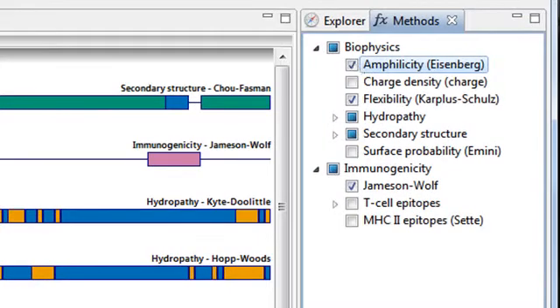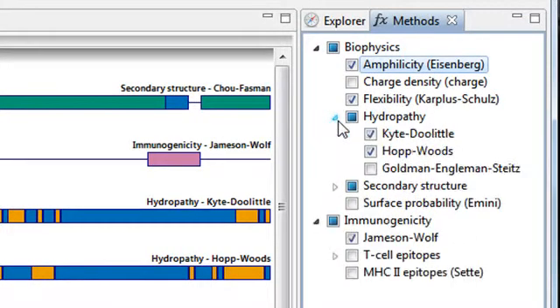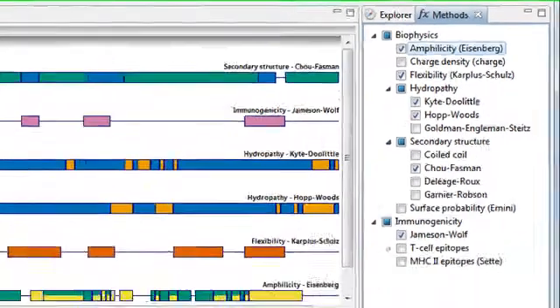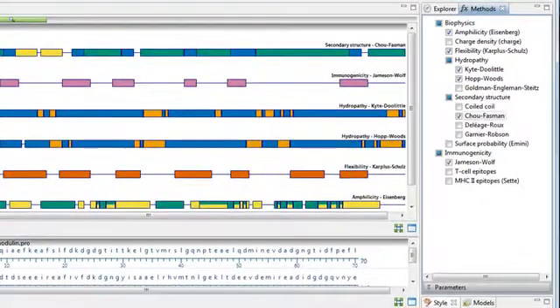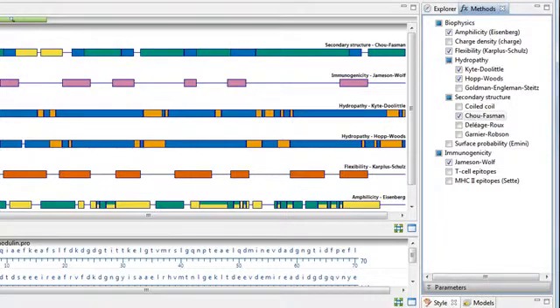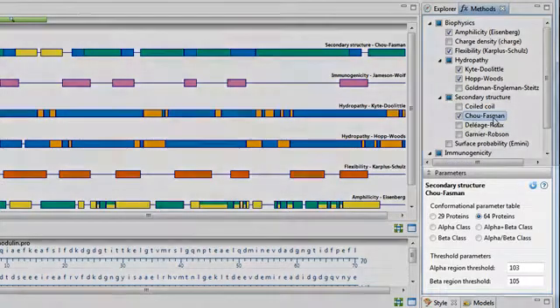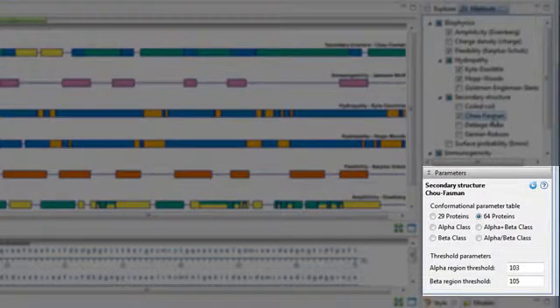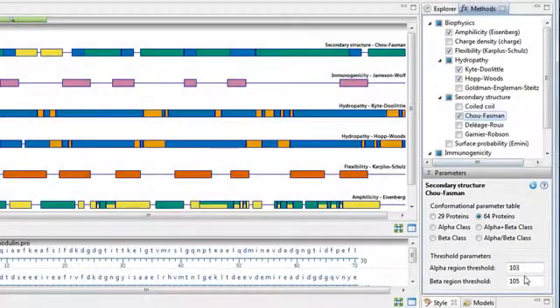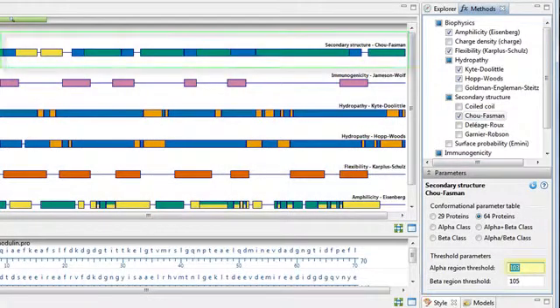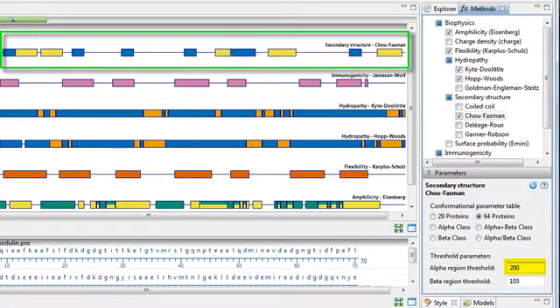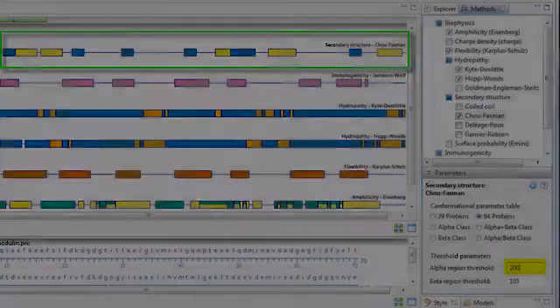Some methods contain sub-methods which can be revealed by clicking on the triangle to the left of their names. To edit the parameters for any method, double-click on its name in the Methods panel. This opens the parameters bar. Updates made to the parameters are reflected instantly in the analysis view.